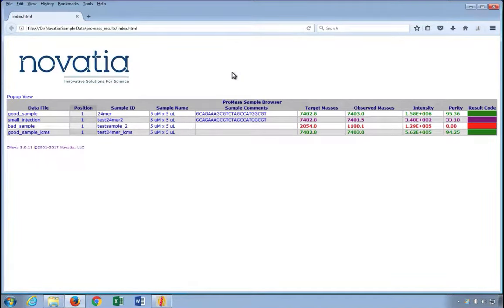This is the results page. Yours won't match mine exactly, but it should look pretty similar.